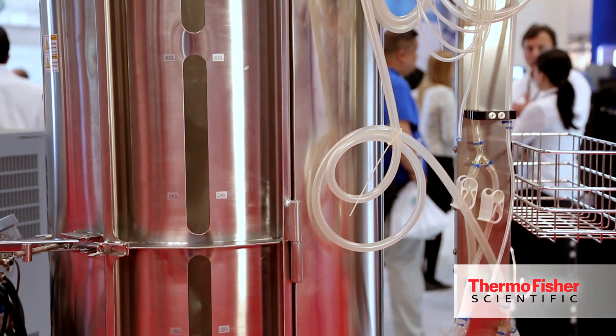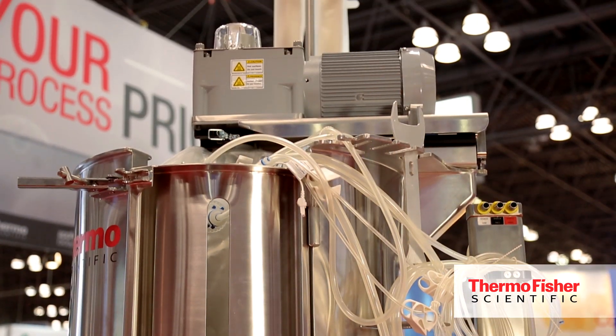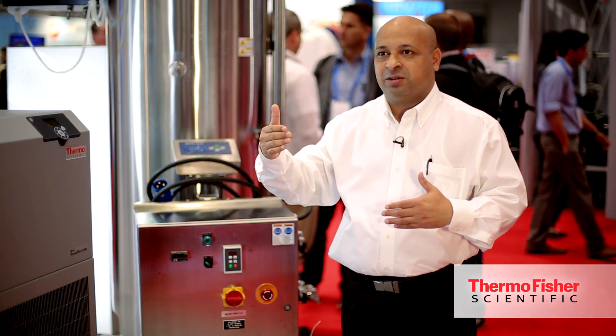Another key parameter is the power-to-volume ratio — the motor delivers power for mixing per unit volume. We have to keep all these parameters constant as we scale up the process, so that when we work at a smaller scale, we can predict performance at the larger scale. That is what is critical for the whole scale-up.